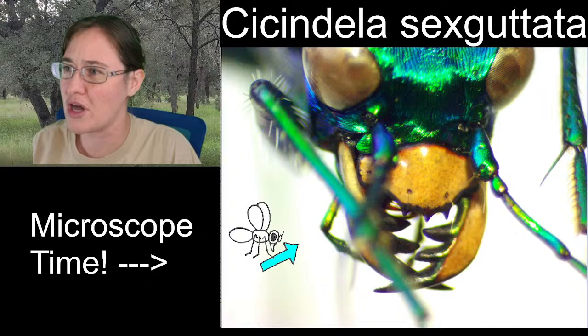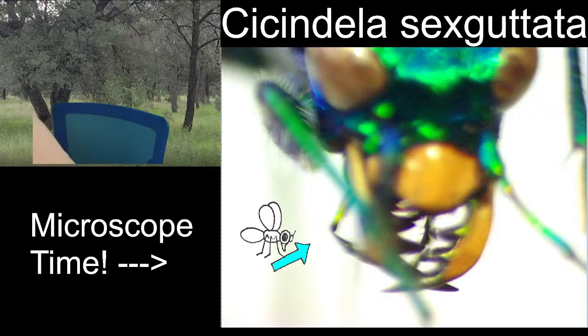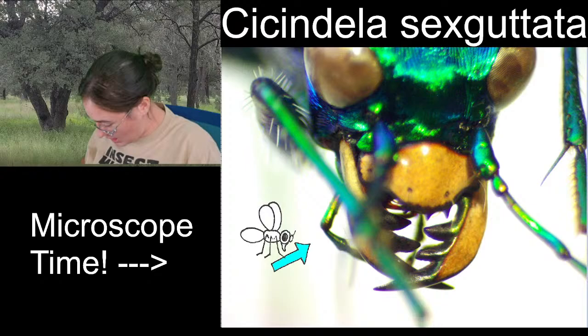So cool. That's one of the labial palps. Or it's one of the mouth palps. I believe it's labial. Let me check. I believe that would be one of our labial palps. But you know where I can definitely know is there is a really cool detailed picture of our head.